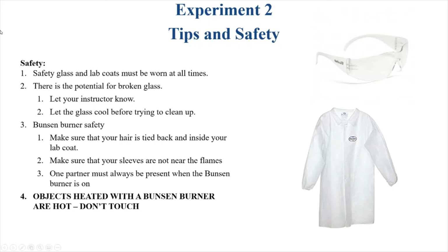And with flame safety, you want to make sure that your hair is always tied back if you have long hair. You want to make sure that if you have long sleeves or baggy clothing, those are pulled back and away from the flames. And it's always important that one person must always be present when a Bunsen burner is on, physically watching it. That's to minimize fire risk.